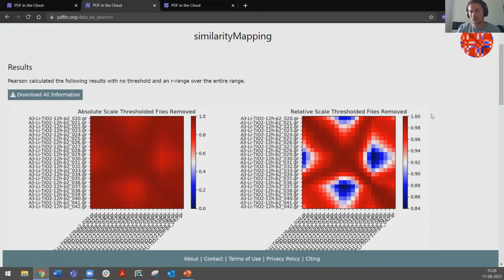However, over here to the right, where we have the relative scale, we can now see that the discharge state here is somewhat different from the charge state here. However, it does resemble the discharge state here. So even though we had some irreversible disorder transition at the deep discharge state, from there on, it seems to have somewhat reversible behavior.